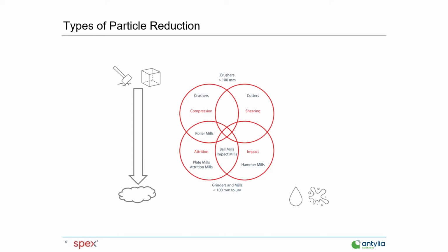Again, if they're wet or malleable, you're going to be using grinders and mills more than crushers, which employ very structured materials.